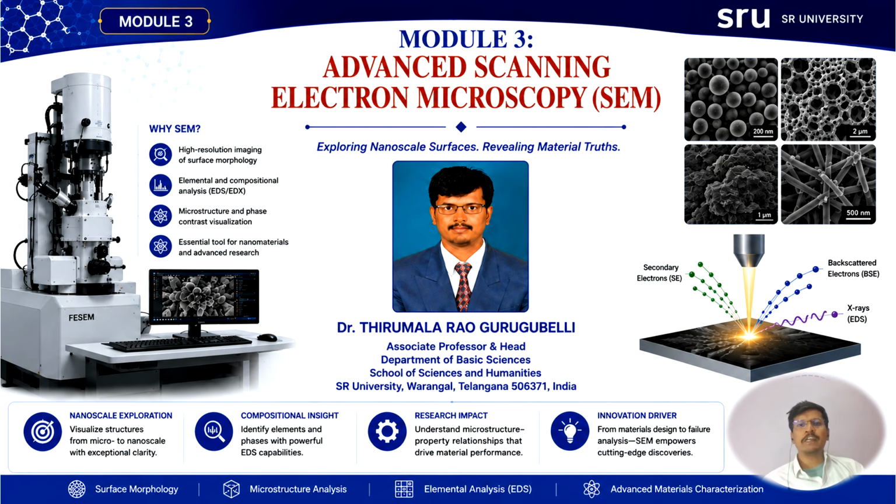In this video, we will learn the fundamentals of electron matter interaction, the SEM instrumentation, imaging modes, sample preparation techniques, the EDS analysis, and advanced applications in material science and nanomaterials research.